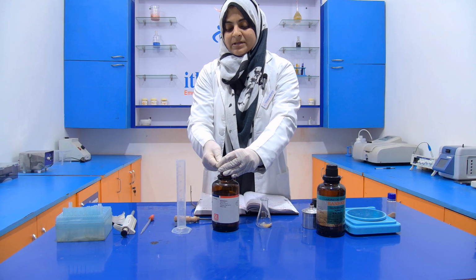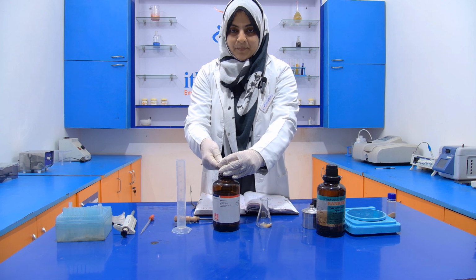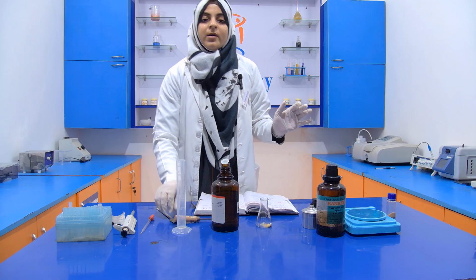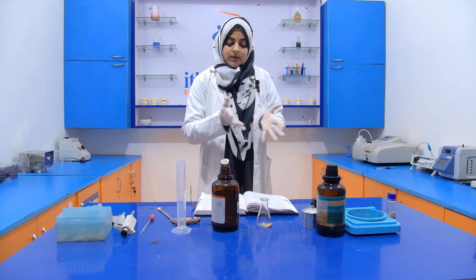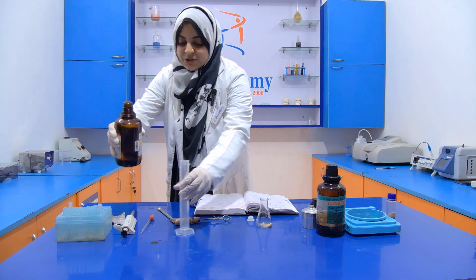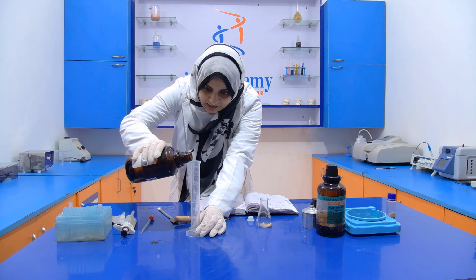If the colophony residue is present, then what happens? Then we get a bright purplish red color, and this bright purplish red color rapidly changes into a violet color, which indicates the presence of colophony residue in the asafoetida.